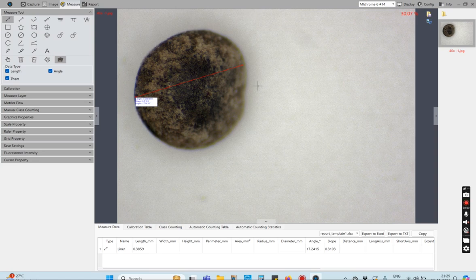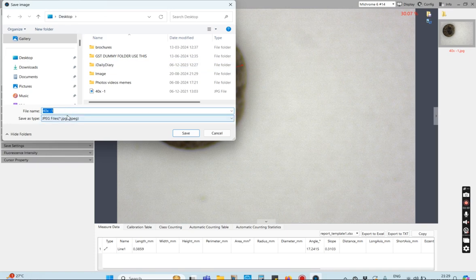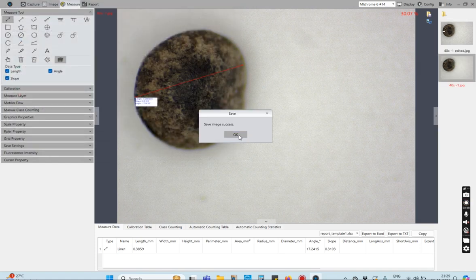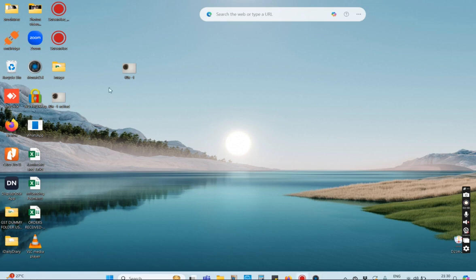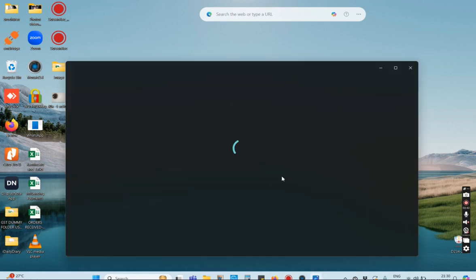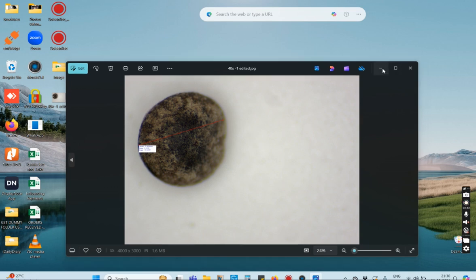Now let's say this is my measured image and I want to save it. I click the Save Image button, navigate to the desired location, and save it. This saved image can be opened in any photo viewer from the path where you saved it.